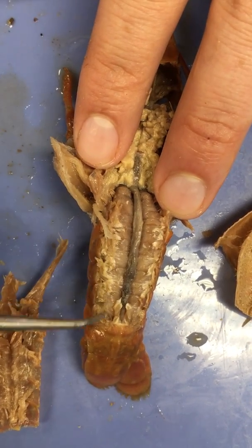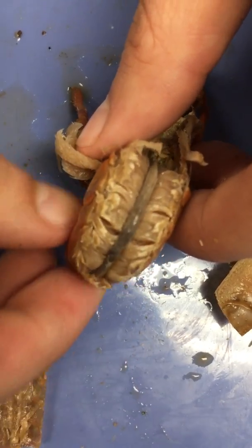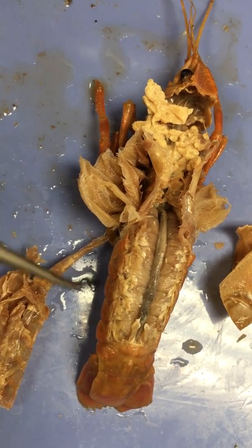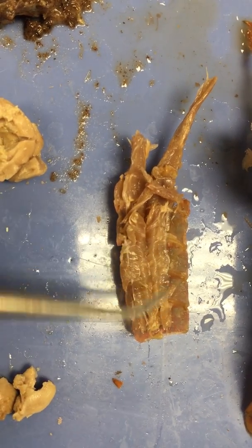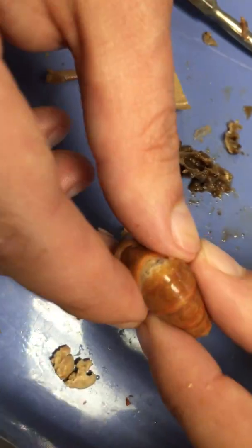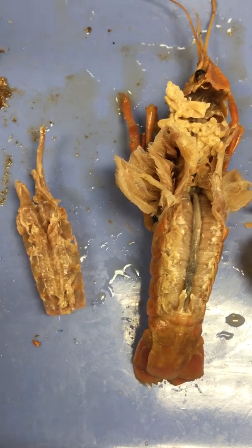Here we see these two big prominent lobes — this is what's called the flexor muscle, and this muscle is responsible for curling the tail. That's the most powerful action the crawfish does; it can curl that tail very, very strongly, because it has these big strong flexor muscles. The antagonistic muscles — the muscles that do the opposite — are attached to the upper side of the exoskeleton in the tail. These are the much weaker, relatively speaking, extensor muscles, responsible for straightening the tail. We have the extensor muscles on top and the flexor muscles on the bottom. That concludes the internal anatomy of the crawfish.